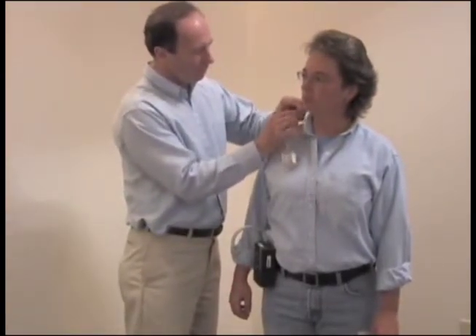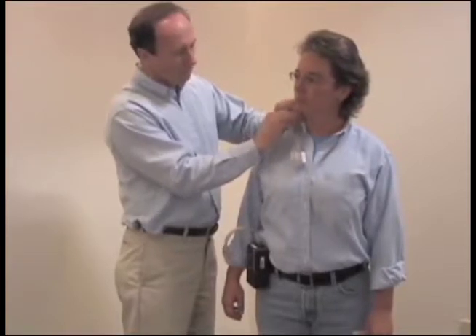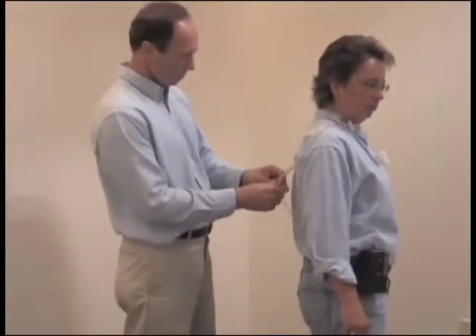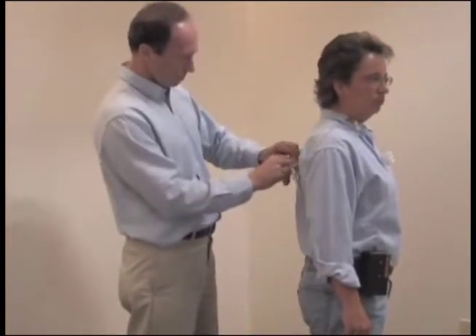Attach the pump to the worker's belt or pocket, either in back or on the side. Bring the tubing around to the front and attach the sampler to the shirt collar in the breathing zone. Use the collar clip to attach the tubing in place along the shirt to restrict its movement.